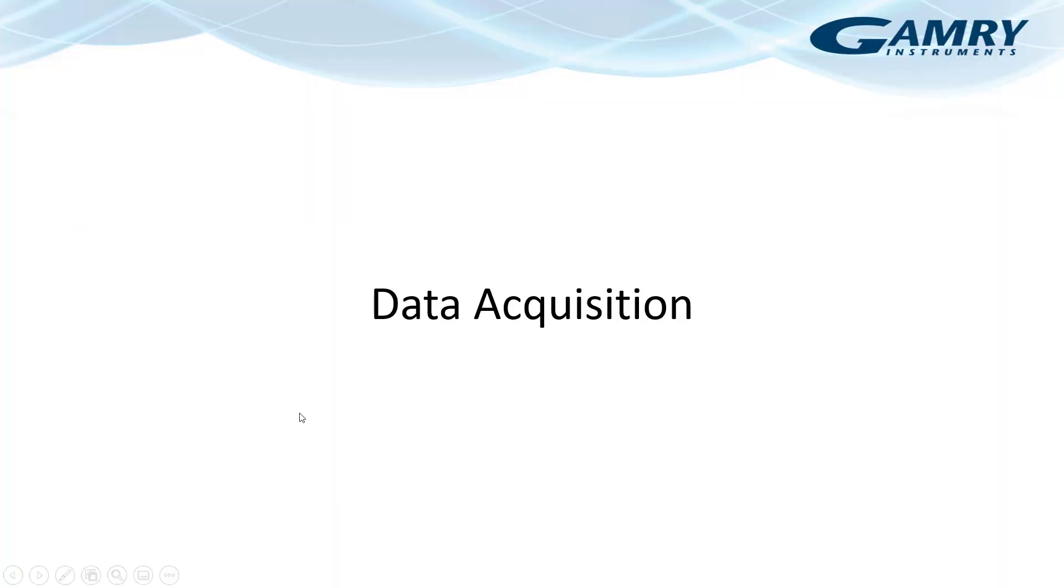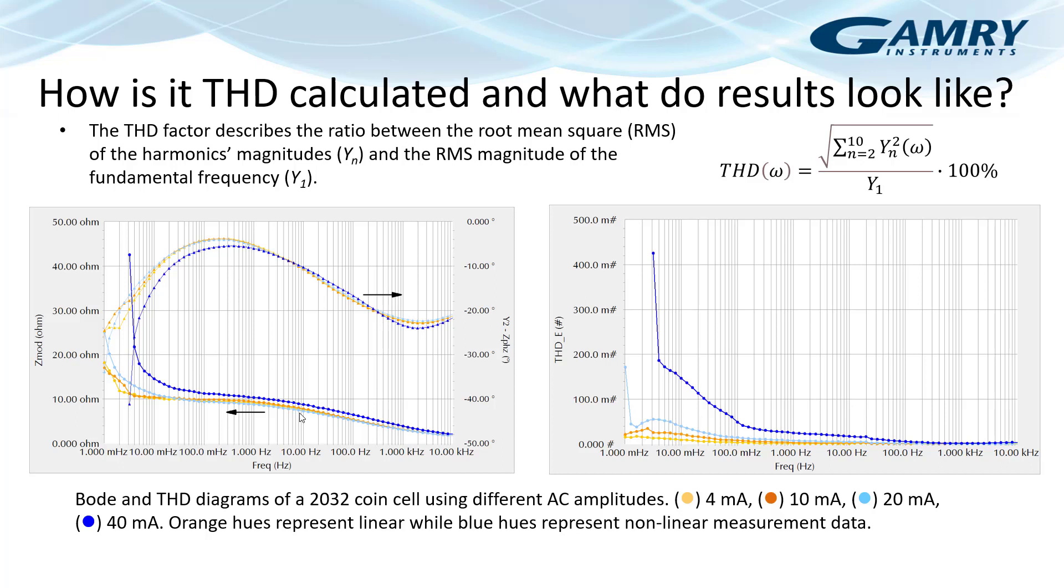So let's jump back to looking at some actual data. Since we're short on time, we don't want to run through a full data acquisition. I'll show you some data that was generated where we measured total harmonic distortion. And then you can see how these results would be presented. So these are impedance plots, Bode plots of 2032 coin cell that we measured at different AC amplitudes. You can see 4 milliamps, 10 milliamps, 20 and 40 milliamps. And in the Bode plot here on the left, we can see a rather nice response. For the gold hues, the gold and orange hues, those are typical linear responses that you would get. But as you can see, as you go to a higher amplitude and higher AC amplitude, you generate some non-linearity at these lower frequencies.